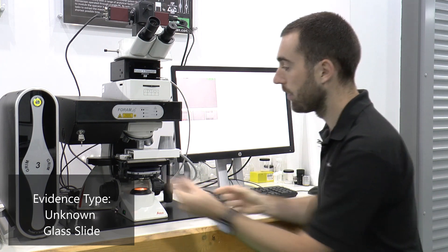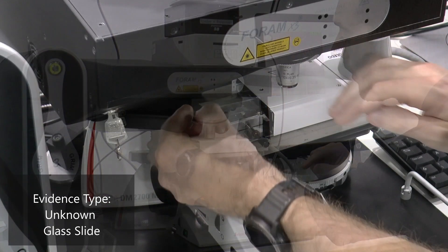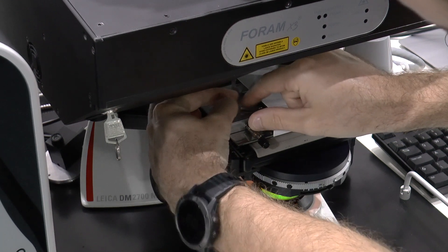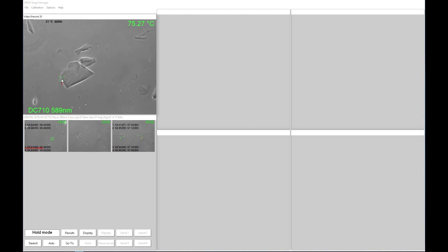The slide is placed within the hot stage and we search for a suitable fragment of glass to measure. Here we have a suitable fragment, and in the GRIM software we can select up to four edges on this particular fragment. We are already at a suitable starting temperature, as indicated by the white glow on the outside of our edges, and clicking Auto begins the measurement process.